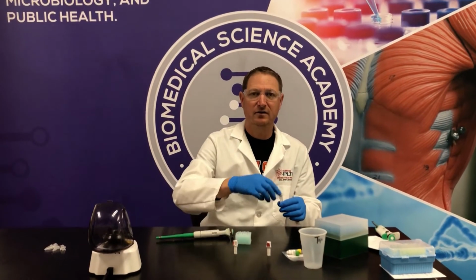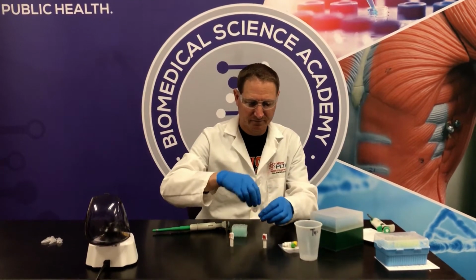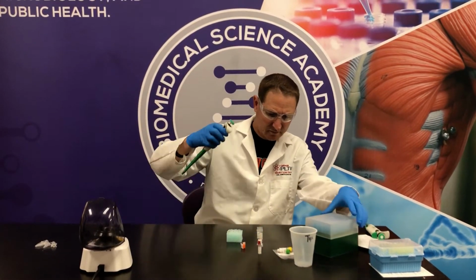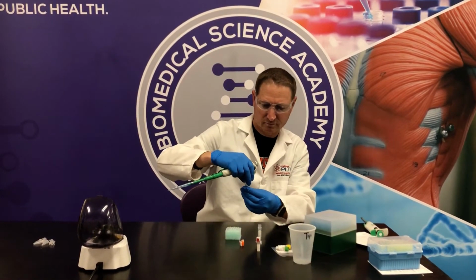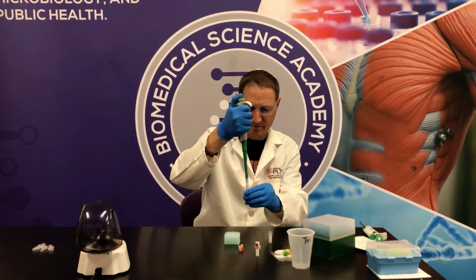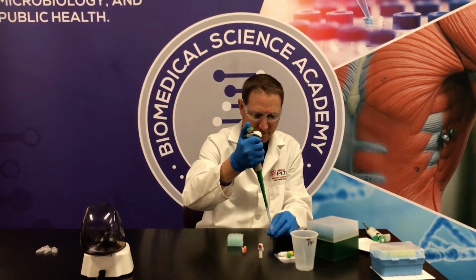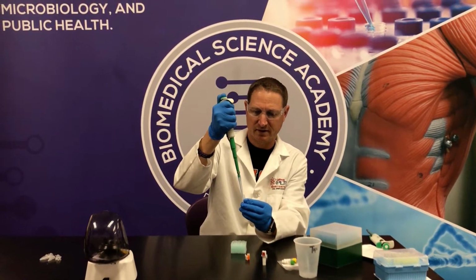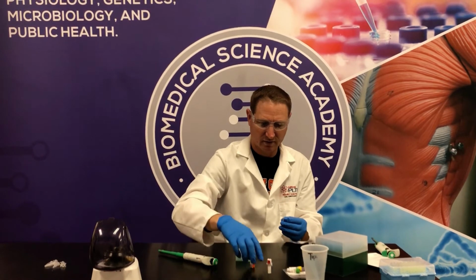Okay, now that I have 150 microliters in my EcoRV, I'm going to put 150 into my HIN3. This is my buffer, 150. I'm going to put it in, and as it says, suck it up, put it back down, suck it up, put it back down, just to mix it. Get rid of my tip, and top back on.